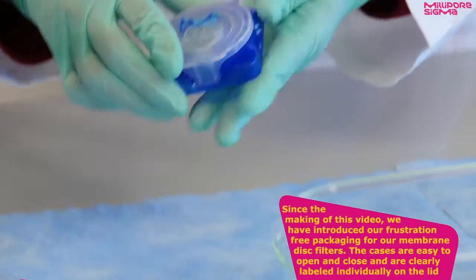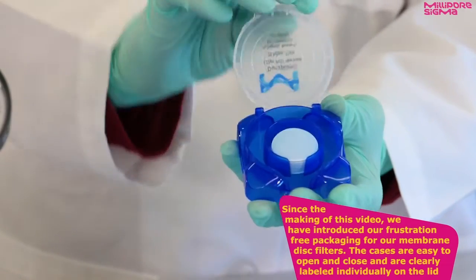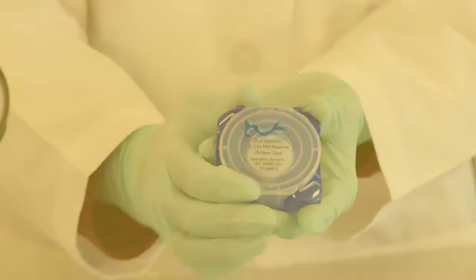Since the making of this video, we have introduced our frustration-free packaging for our membrane disc filters. The cases are easy to open and close and are clearly labeled individually on the lid.